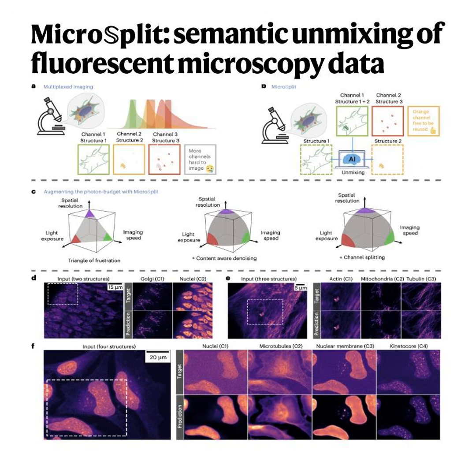If you're looking at an incredibly dense overlapping image patch, you can't determine what a specific pixel belongs to just by looking at its immediate neighbors. It's like trying to identify the architecture of an entire cathedral by just staring through a magnifying glass at a single brick. That's exactly it. You need to see the whole building. So it forces the network to pull back and see the cathedral.